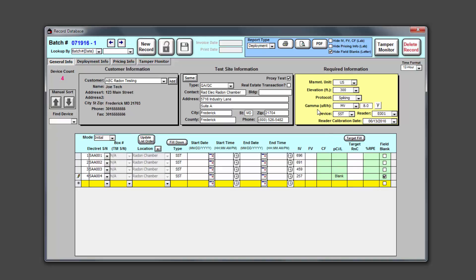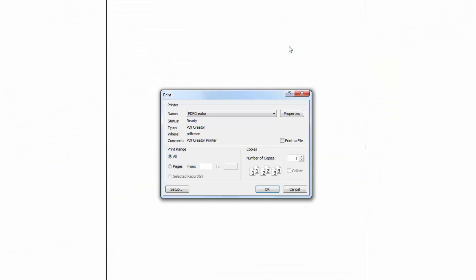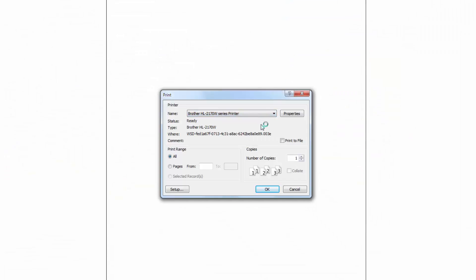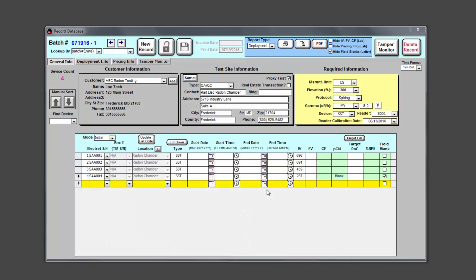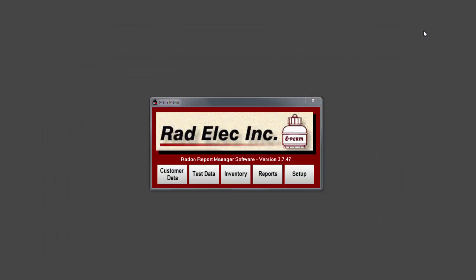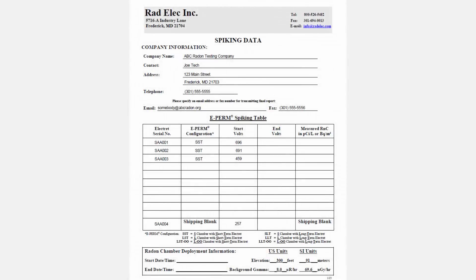After we've finished entering in our detectors and field blank, let's print out a deployment sheet that we'll include along with the detectors to be mailed to Radelec — this is going to be our spiking service form. Then we can save the record, close it, and exit out of the Radon Report Manager. If you don't have the software, that's perfectly fine. You can head to Radelec's website and print out either a PDF or download a Word document of the spiking service form.